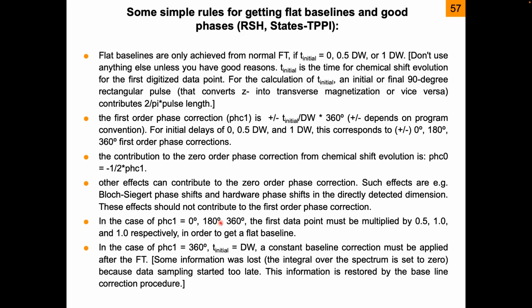But when I'm at time 0, then my digitizer measures the signal at time 0. This is what comes in the signal. But the Fourier transform thinks it's the integral of the signal from half a dwell time before 0 until half a dwell time after 0. And because we think that the whole signal is causal, meaning there is no signal before time 0, you have this factor of a half in the integral that you need to take into account.